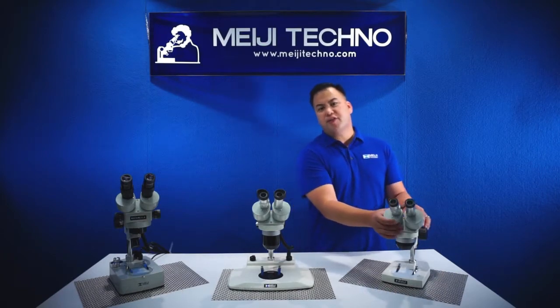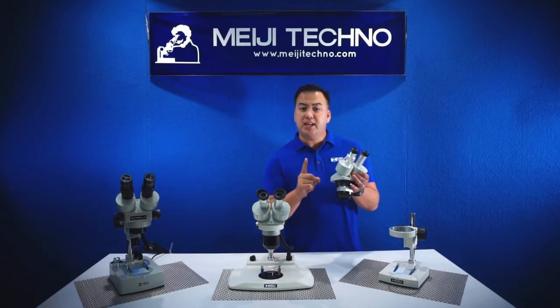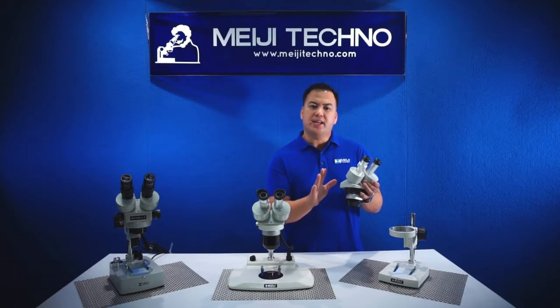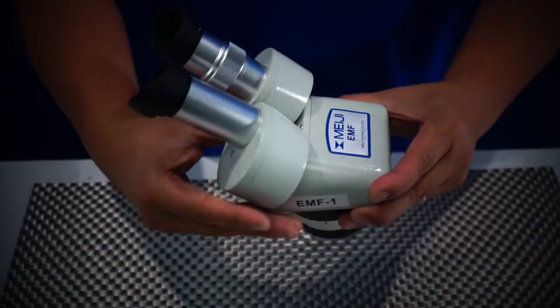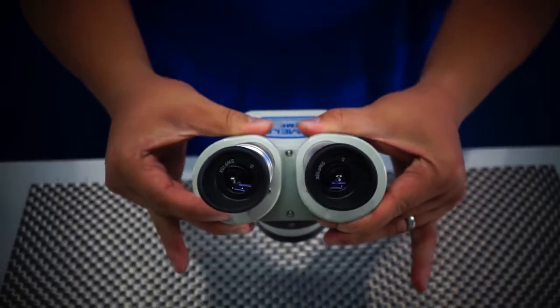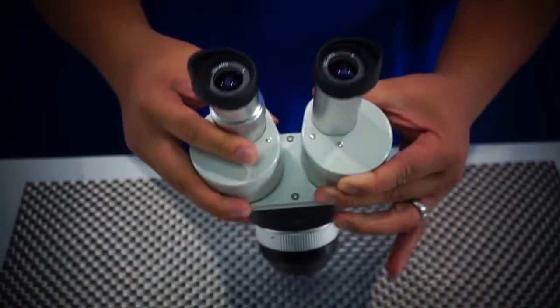Our EMF Fixed Body is our most affordable system available. It has a fixed body meaning it only has one magnification setting per body. The EMF series is currently available in two models: the EMF1 which has a 1x objective and the EMF2 which has a 2x objective. Both give the user 108 millimeters of working distance, or 4.2 inches.